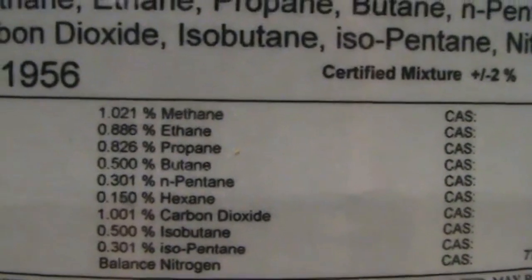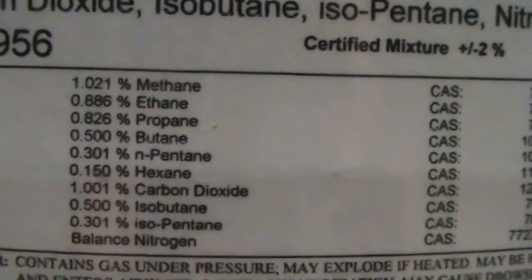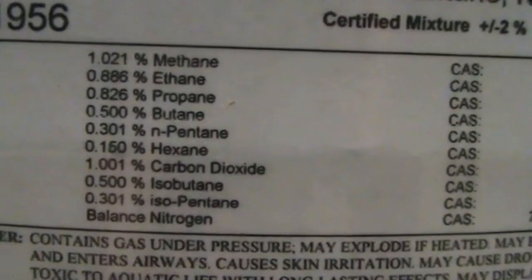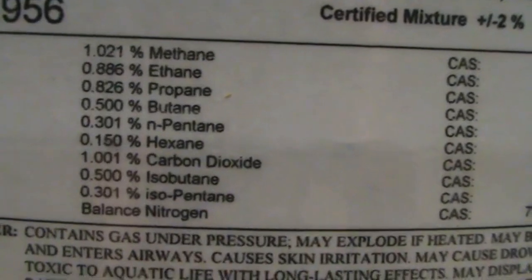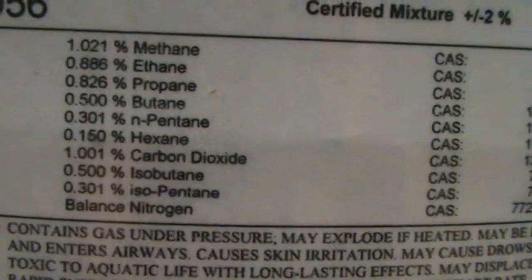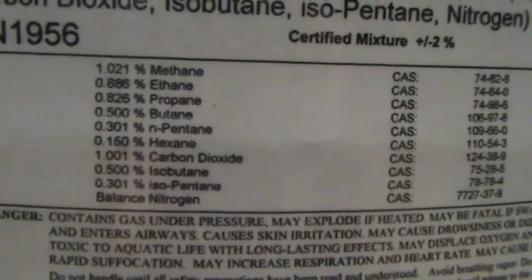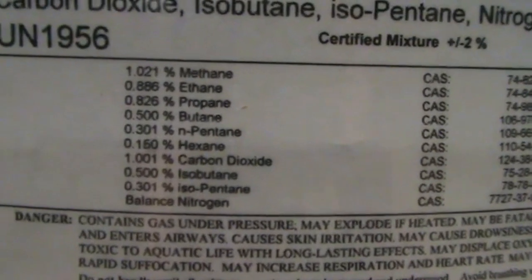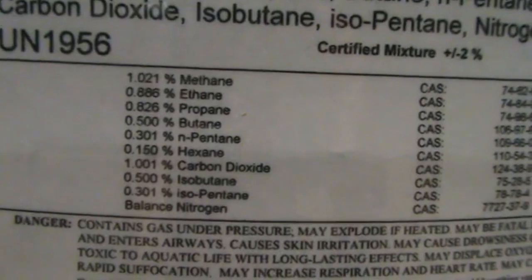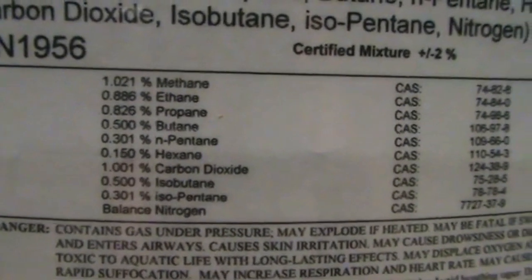So there's our methane, ethane, propane, butane, normal pentane, hexane, carbon dioxide, isobutane, isopentane, and nitrogen. So we got some C5, C6. Oh, we got some super lights and balanced nitrogen. So almost all of this bottle is nitrogen. Literally, there's just smidgens of the other stuff in there, and mainly we are just nitrogen in this bottle.